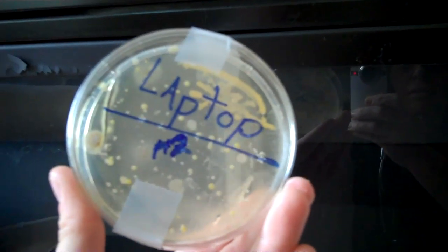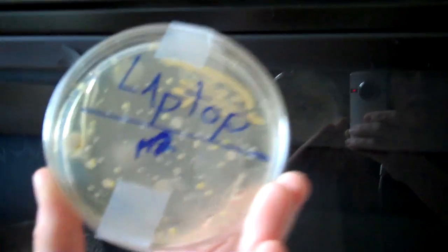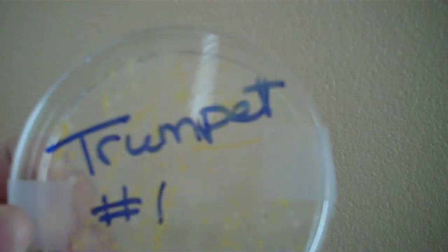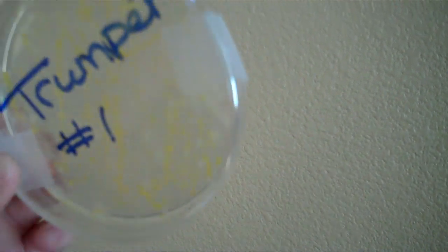This is day 6 of my agar. This is laptop number 2 — here's the back side. There are lots of organisms, it's a big organism, lots of life. You probably can't see it on the camera. This is my control dish — there's nothing in here because it's the control; I didn't swab anything. This is day 4 of the trumpet number 1 — pointing out the white specks.